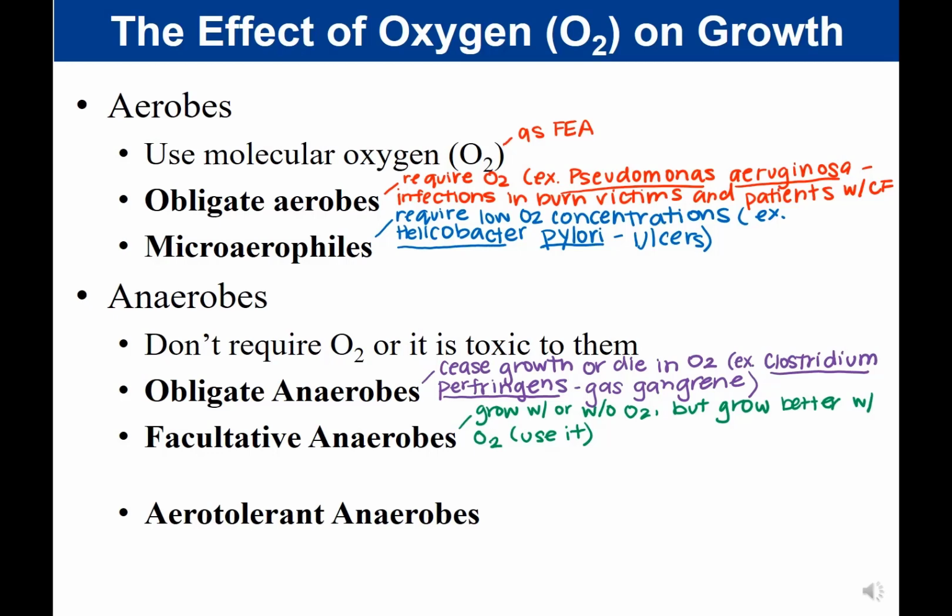And so you might recall that we had some colonies on the top of the agar and some colonies embedded in the agar. If you recall what that looked like, the colonies on the top of the agar were very large, and the colonies that were embedded in the middle of the agar were teeny tiny little dots.